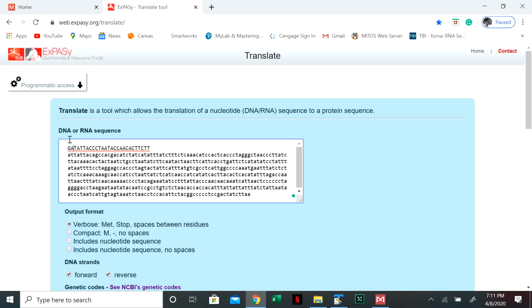When you hit the next gene, you can occasionally go into the overlapping space, but that's rare. The other way you can do it is you can look for when the next stop codon is before the start codon. In this scenario, there's not going to be a stop codon before I hit the next gene, so I'm going to run all the way backwards to the next gene.